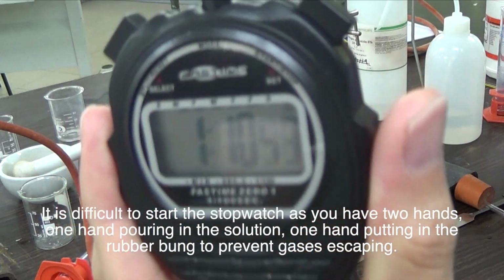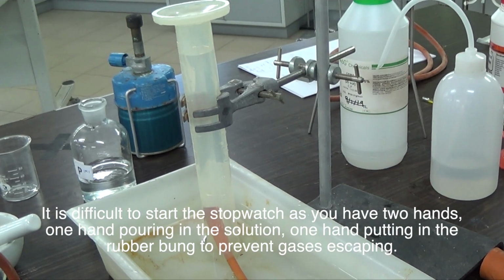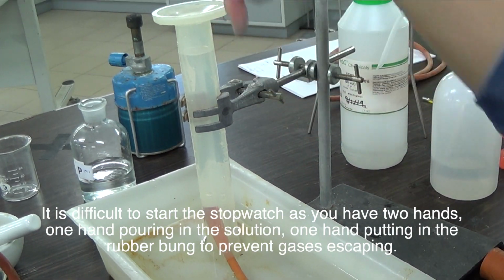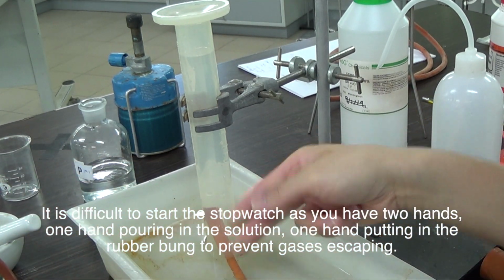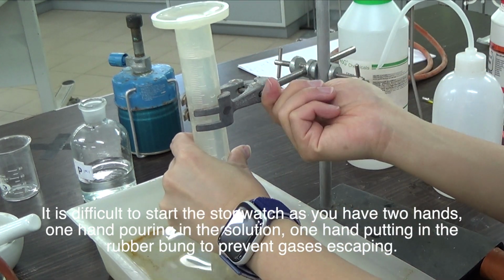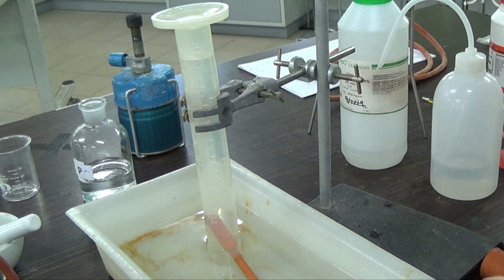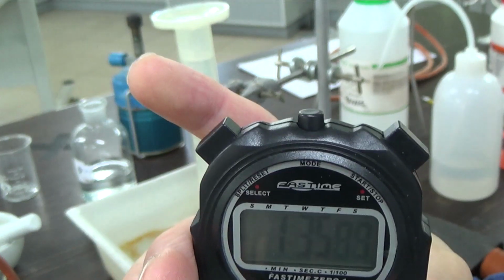Regardless, the time is still going, but you could see the rate of production, the rate of reaction, is pretty slow. The volume of water has come down because the gas that is being produced passes through the delivery tube, and the gas fills up the space. Just now it started from 0. Now it's around 15 cm cube. So what I'm going to do is record the volume of gas produced in 2 minutes.